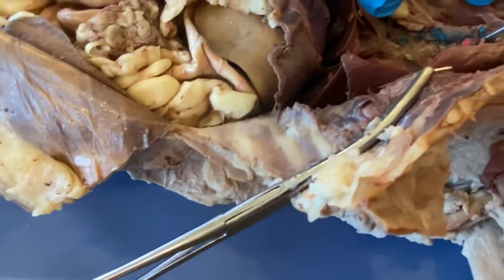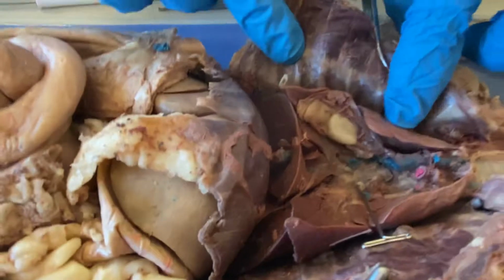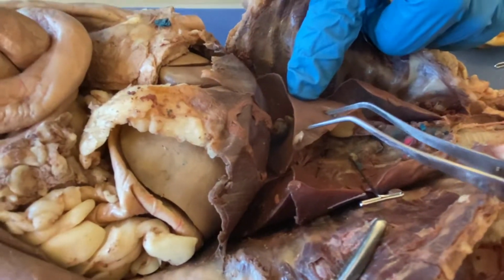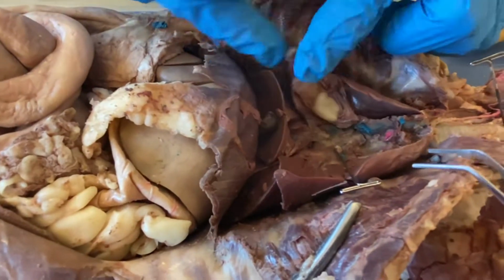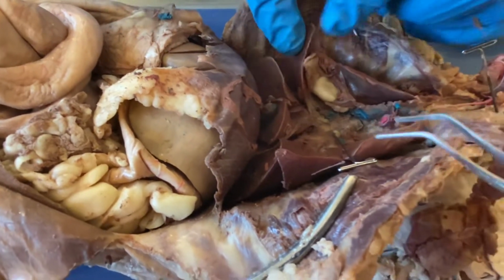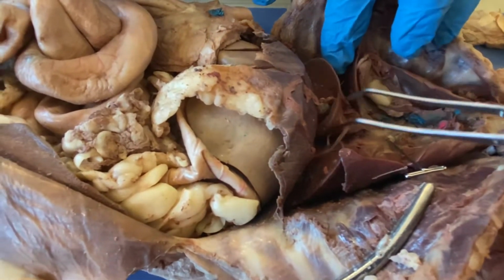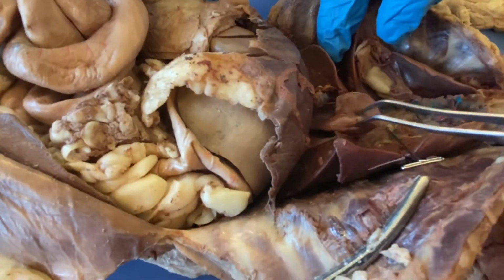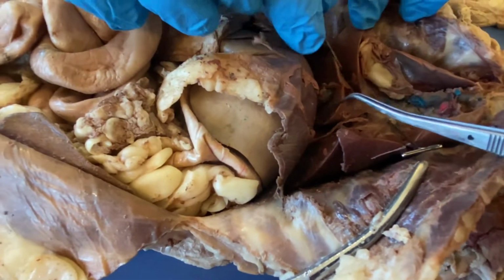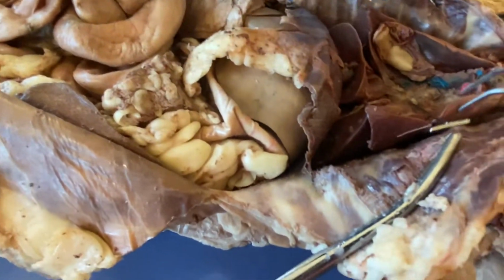All right, then we have the right lung lobes. We have the anterior lobe, which is the most superior, the medial lobe, which is in the middle, hence medial, and the posterior lobe, which is at the end. But this one on the right side has an extra little thing called the mediastinal lobe, which is medial on the posterior right lobe. Which is this thing, isn't it? I believe so. That's our extra little sweet thing going on.